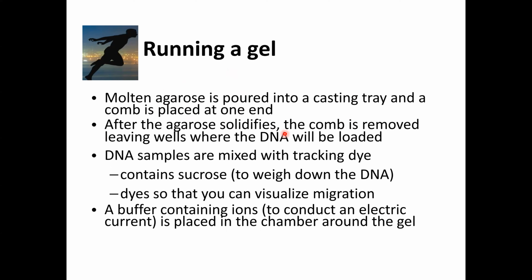After pouring the agarose gel, you have to wait around 20 to 30 minutes for your agarose gel to solidify. Then you gently remove the comb. You must not be hasty when removing it because it will damage the gel, so just be gentle and careful.